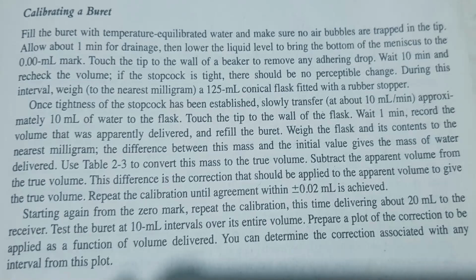So we transfer approximately 10 ml of water to the flask. Take note, it's 10 ml of water. We can see it on the burette, right? It starts from the 0 mark up to 10 ml. Transfer it to the flask. Make sure everything is transferred to the flask. We even have to touch the tip to the wall of the flask so that all the liquid is drained and reaches our receiving flask. And then we can refill the burette after.